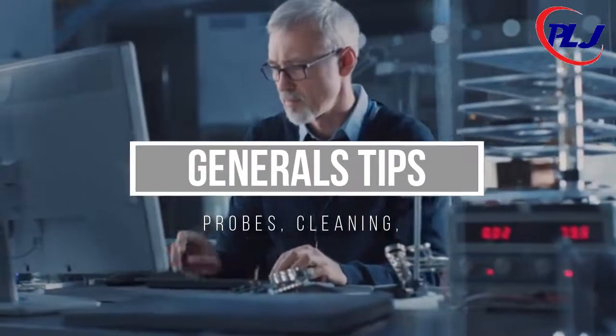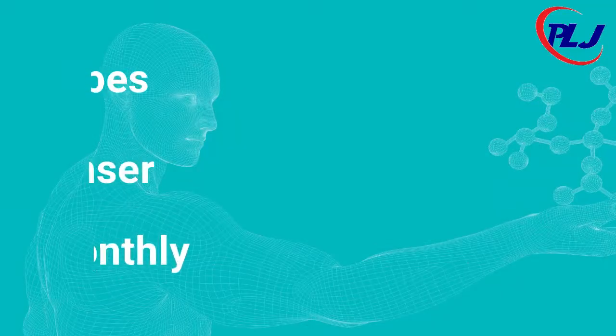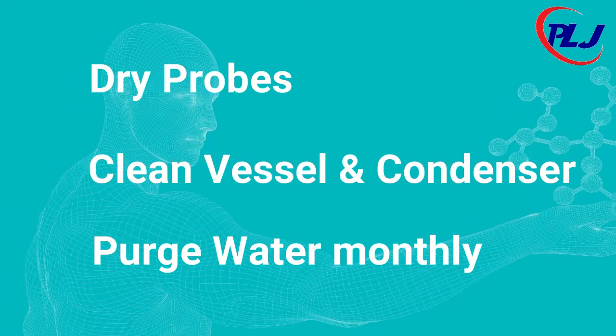Here are some general tips on handling the fermenter. Ensure to regularly clean the vessel and the condenser. When handling the probes, ensure not to immerse the probes in deionized water for too long. This could cause irreparable damage to the probe. Ensure to purge the water out of your tubes and system regularly to prevent sedimentation.